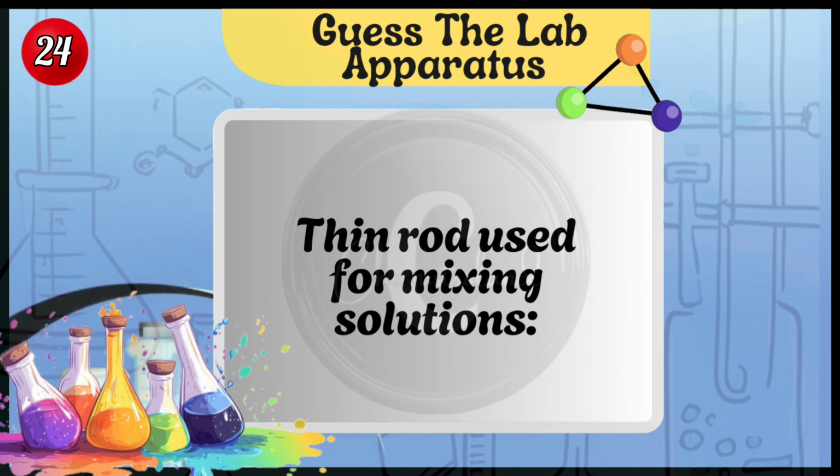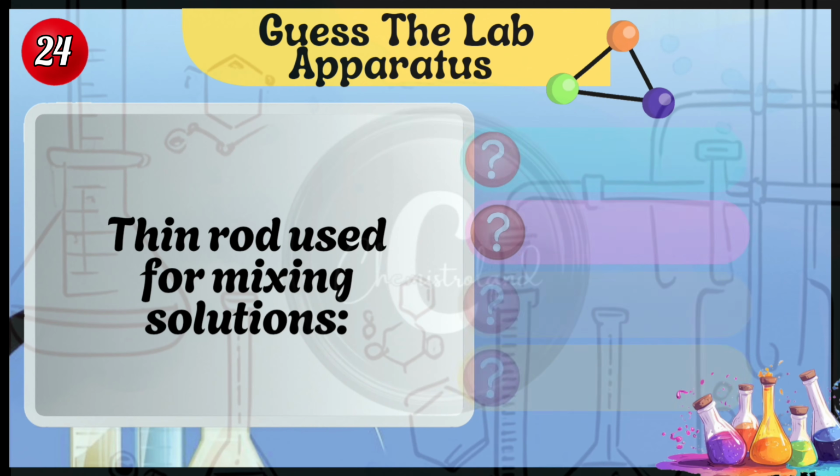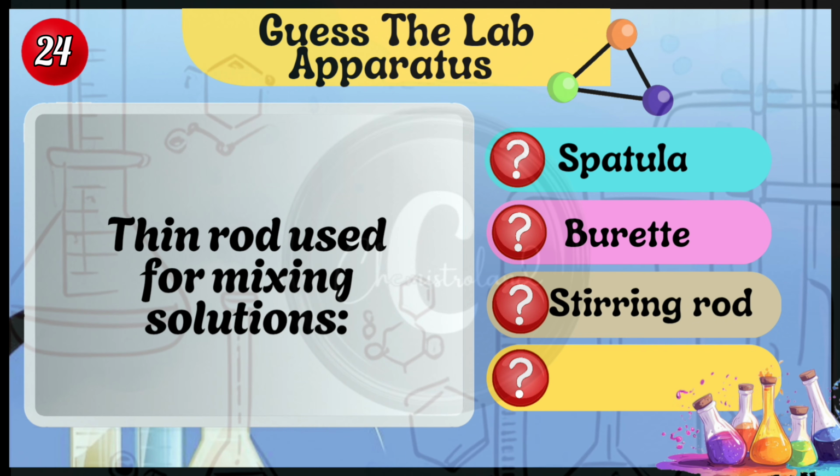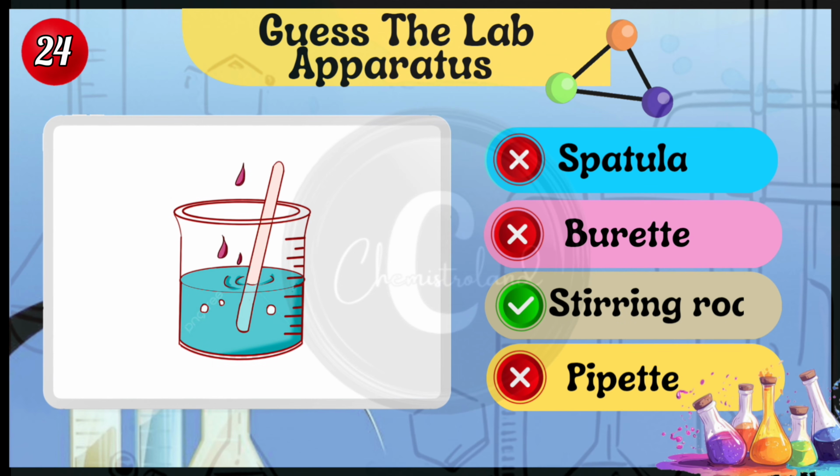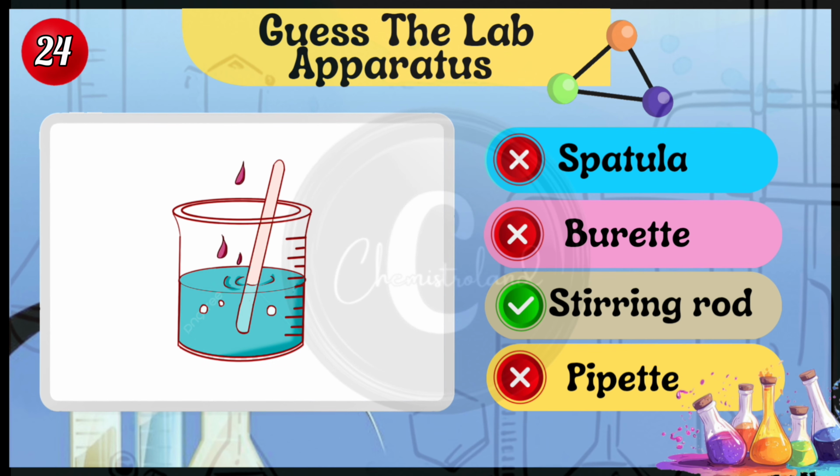Thin rod used for mixing solutions. Spatula, burette, stirring rod, pipette. Stirring rod, also known as glass rod.